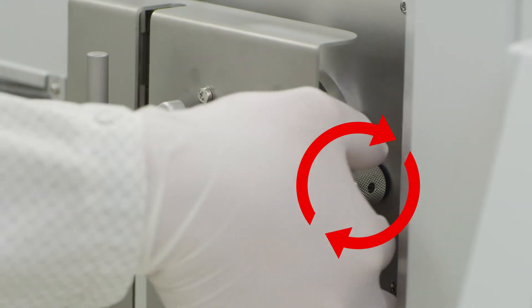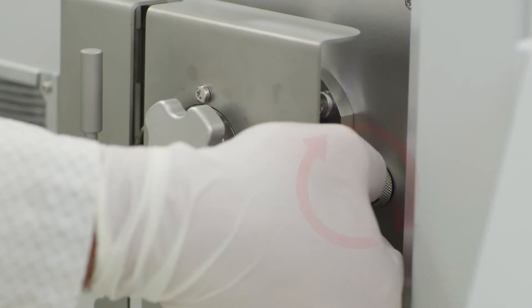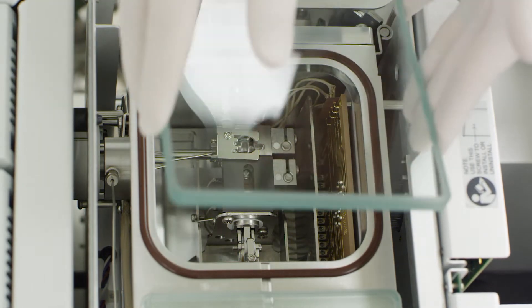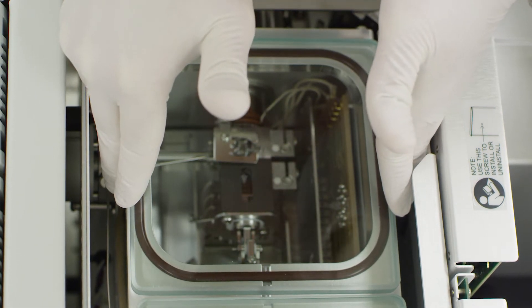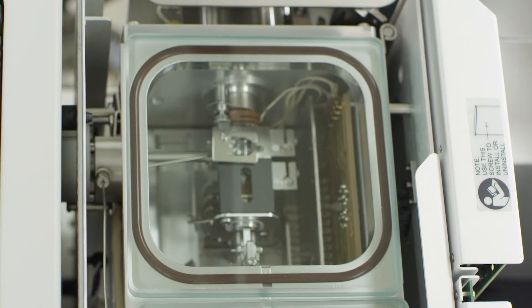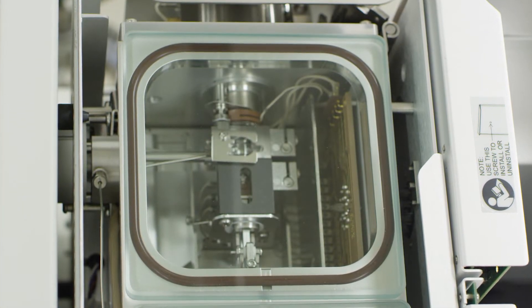Replace the four screws which secure the manifold door to the mass spectrometer. Behind the manifold cover, locate and close the manual vent. Replace the glass top to the assembly. Take great care to ensure that the glass cover is seated evenly. This will ensure that the instrument will be able to achieve and hold vacuum. Note, while the pump is achieving vacuum, you may have to place pressure on this piece of glass.